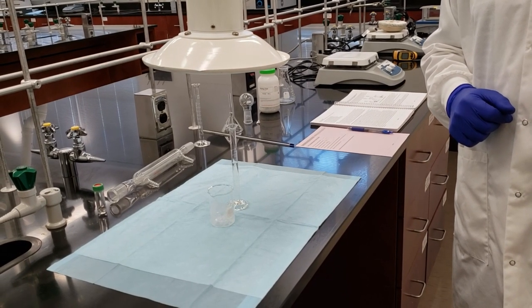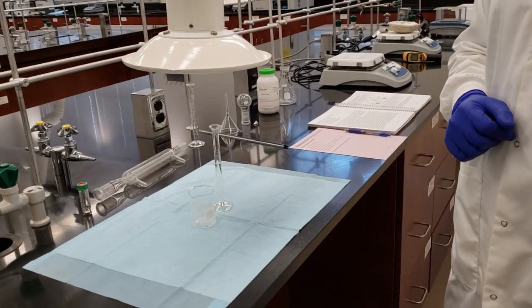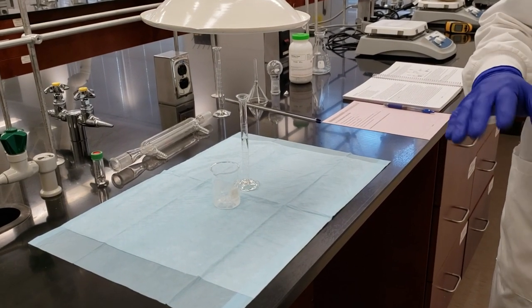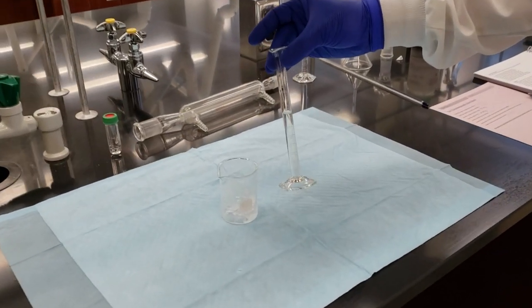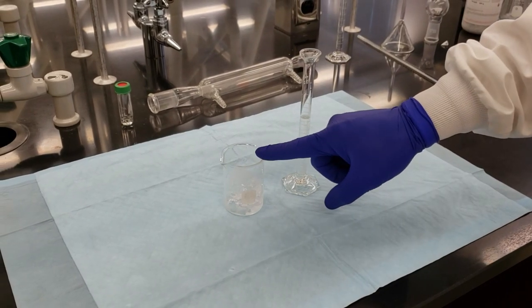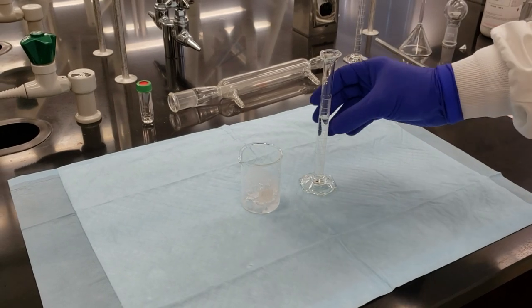CHEM 2211, this is our gas chromatography experiment where we convert an alcohol into a pair of alkyl halides, a chloride and a bromide. We're going to start out with 7.5 mL of concentrated sulfuric acid. We've got 10 grams of ice in a 100 mL beaker. We're going to mix those two together.